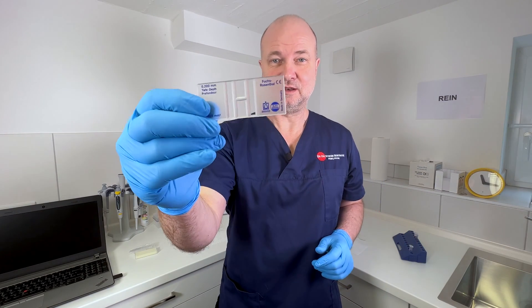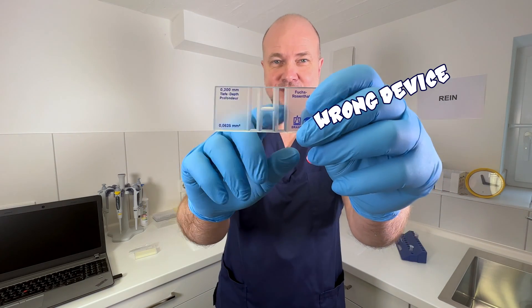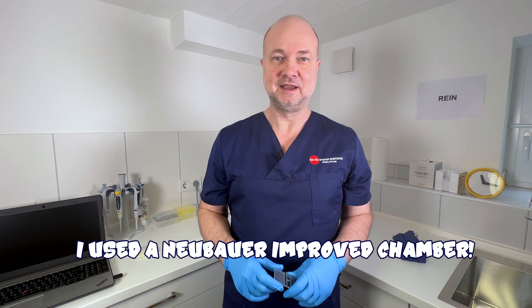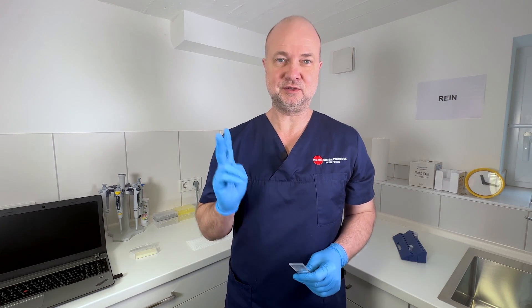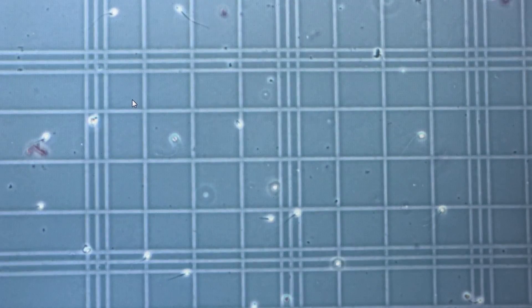Now it's time for counting. I'm using this Neubauer improved counting chamber. You can't see it here, but there are very small squares on this chamber — you can only see them under the microscope. I'm putting two samples of the solution on the slide and counting twice in order not to make any mistakes. This is how it looks: you can see all those squares, and within the squares the sperm are distributed.